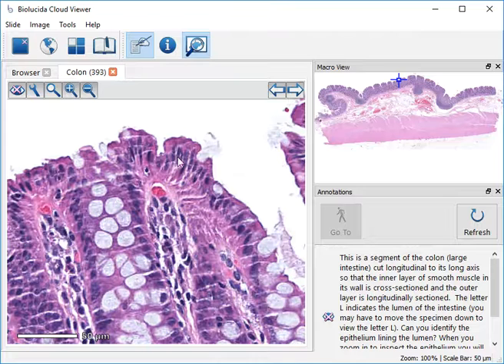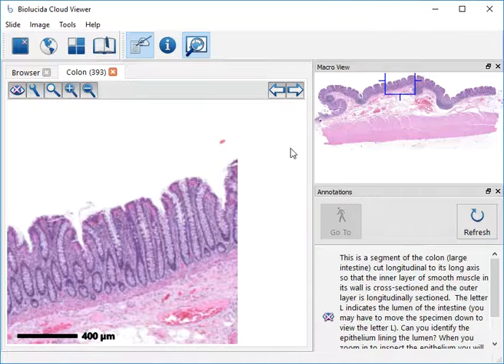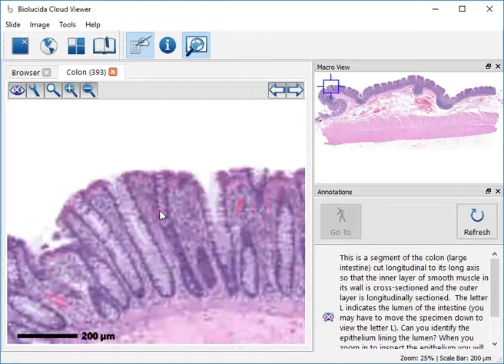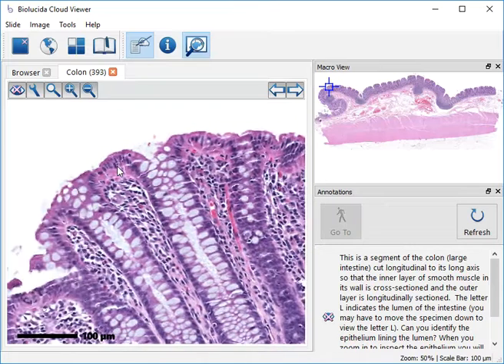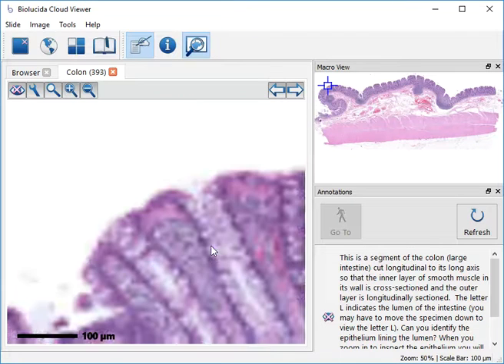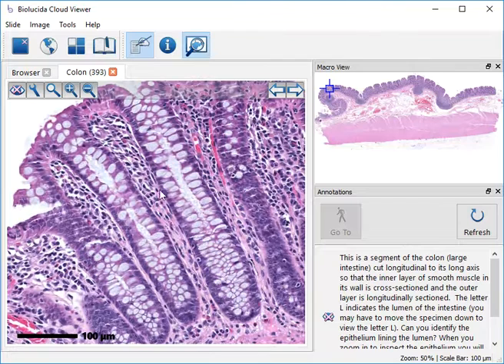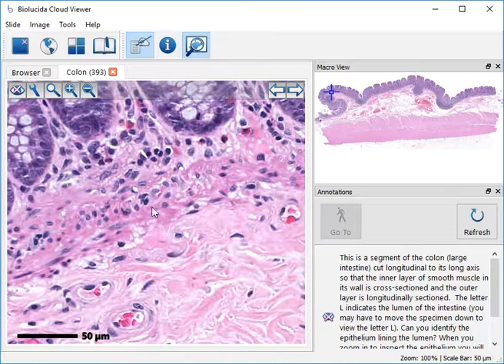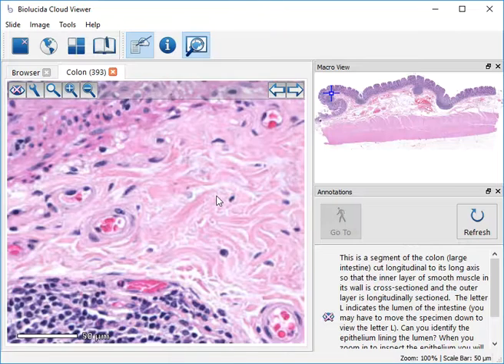And another example of the simple columnar epithelium. So in your study, you can just look around and move from one place to the other like this and find even better examples. So here's a good example where you have no goblet cells. These are absorptive cells, and these are just loaded with goblet cells. You can see the loose connective tissue between, and then it merges down here, and there is some smooth muscle down here, and then a little bit more dense connective tissue here, dense irregular.